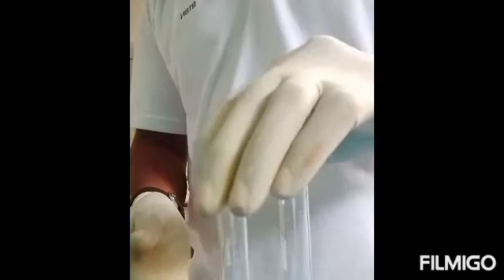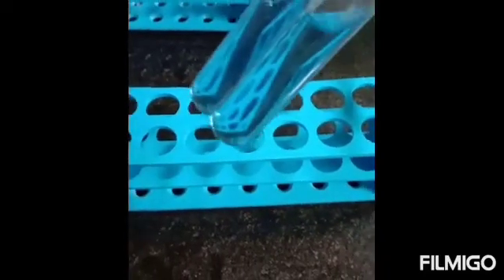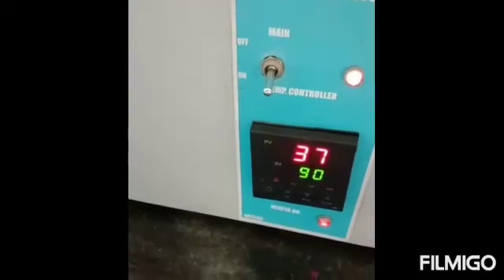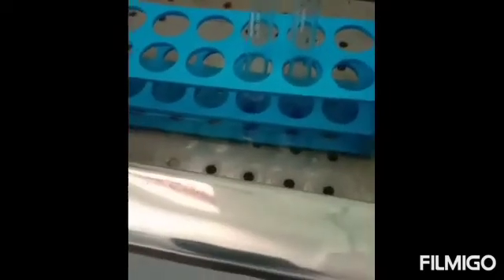The tubes are shaken well. These tubes can be kept at room temperature for 10 minutes, or alternatively we can use a water bath kept at 37 degrees Celsius. The tubes can be kept for 5 minutes at 37 degrees Celsius or 10 minutes at room temperature.